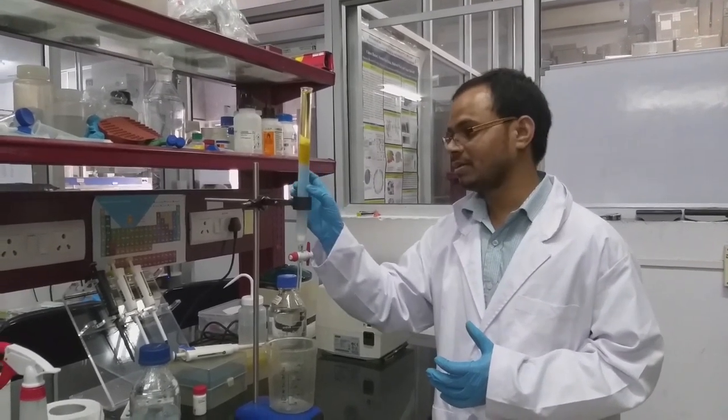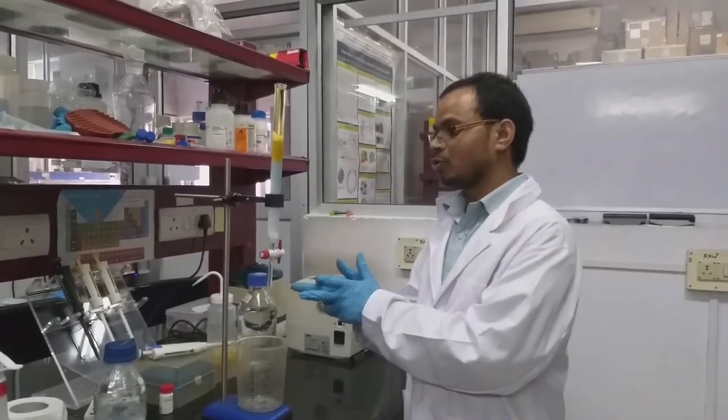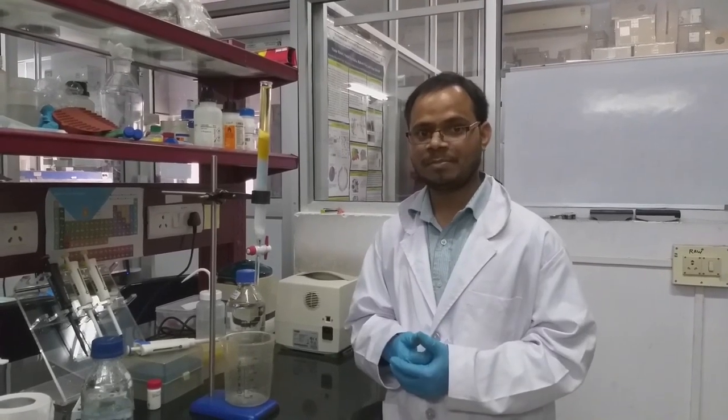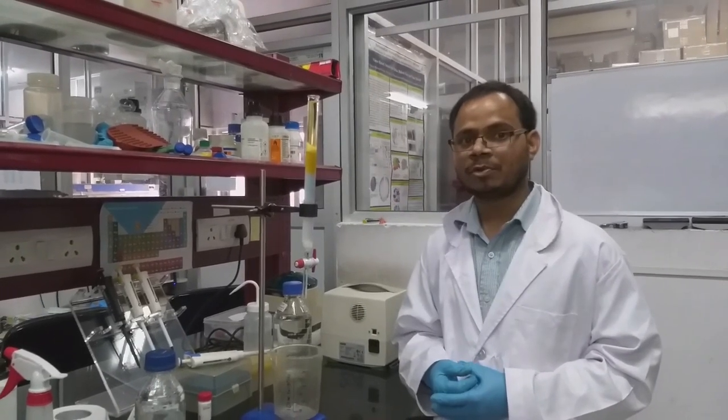As you can clearly see, the blue dextran band is eluting out. So you have to collect this and check for purity. Suppose you are separating three different proteins, one of 70 kDa, another of 100 kDa, and another of 300 kDa. According to the principle of gel filtration chromatography, based on size and shape, the 300 kDa protein elutes first. You collect the initial fractions, which give you the 300 kDa protein, and the 100 kDa protein comes later, and at last the 70 kDa protein elutes.